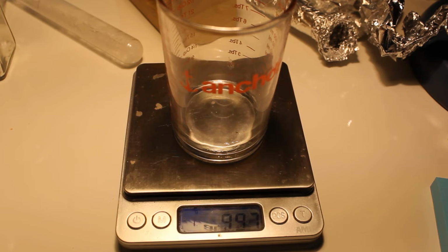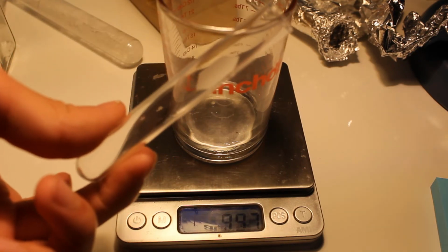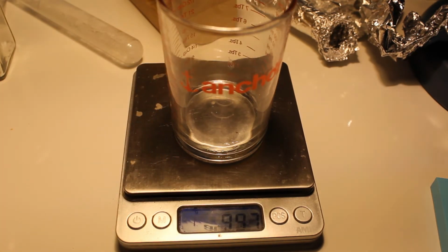Now you might notice a problem. That is nothing. So, my solution is these tiny test tubes. Look at them, they're so small. And that should be enough to hold the solvent. I also have little plugs for them, so it should be enough. I'll make a little block or something to put it into in order to hold it well.